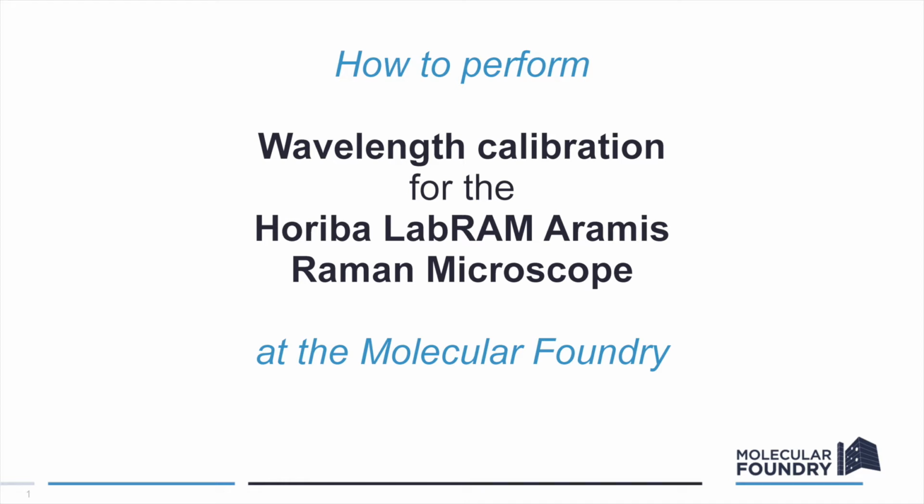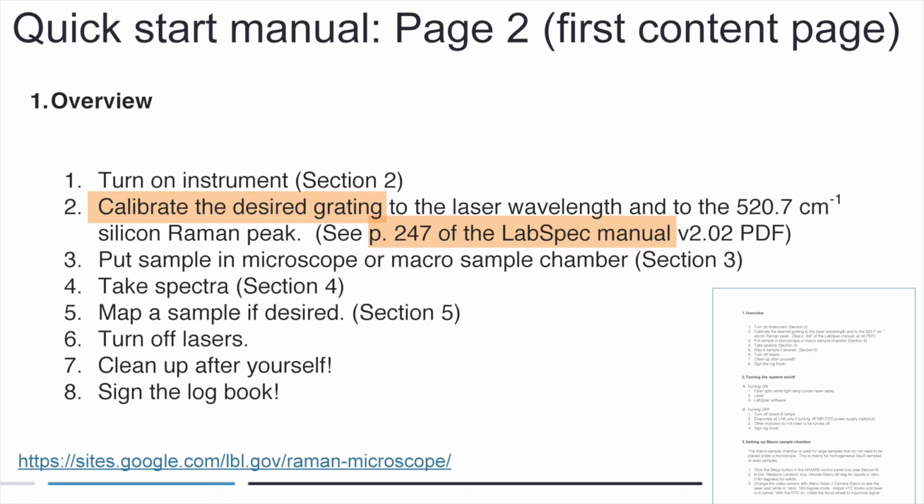In this video, you'll learn how to calibrate the spectrometer of the Horiba LabRAM Raman microscope at the Molecular Foundry. On the first page of the Quick Start manual, you'll find a reference to the Horiba LabSpec manual. Go to the page number specified in the manual.